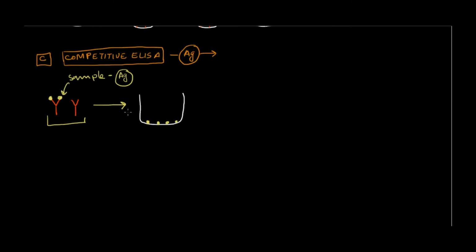So what I did first, took my sample, mixed it with the antibody. This antibody is against whatever antigen that I'm trying to detect. If the antigen is present, it will go and bind to this antibody. Simple enough. Here in this case, I have one antibody extra left. So now I have this reaction mix. Now I will add this reaction mix in the ELISA plate. And here the wells are coated with the recombinant antigen that I'm looking for.